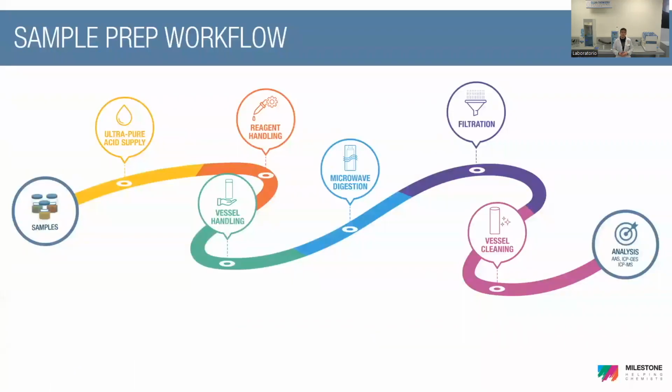As my colleague and I introduced during our previous presentation, we have seen the concept of the overall sample preparation workflow, focusing on the importance of considering each single step involved in the sample prep, starting from the weighing of the sample until the final analysis by AAS or ICP systems.